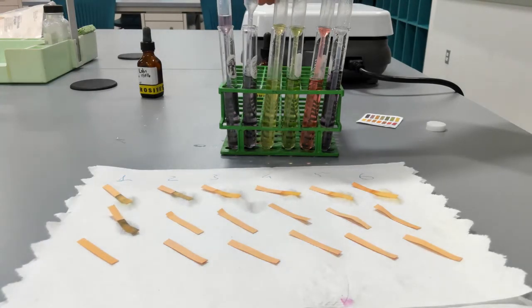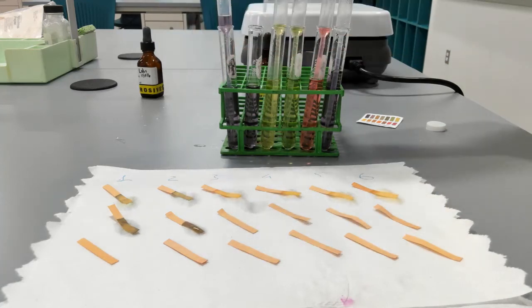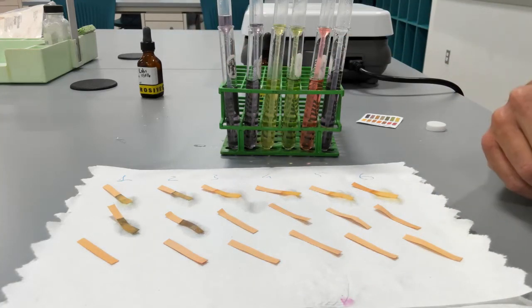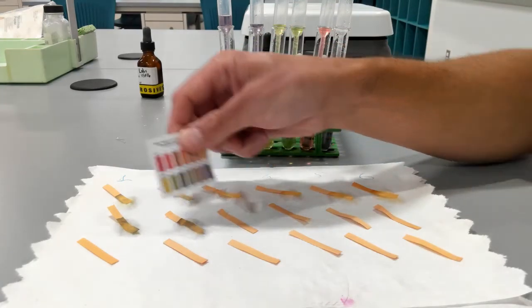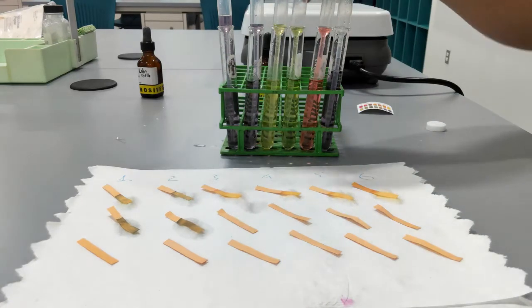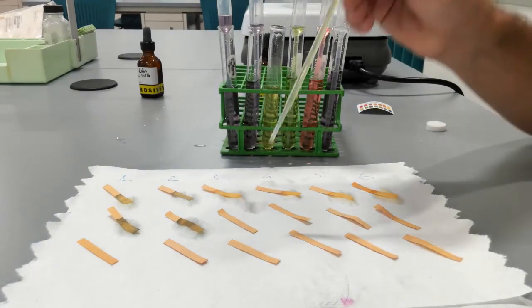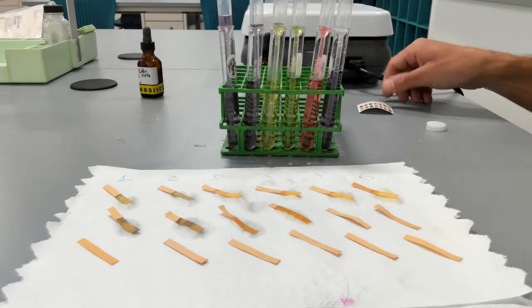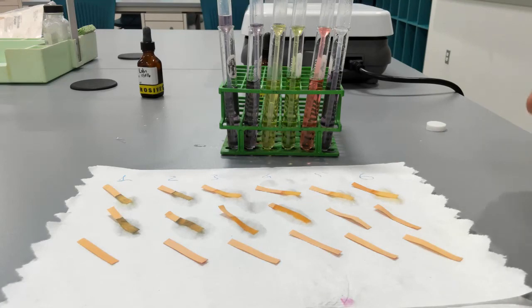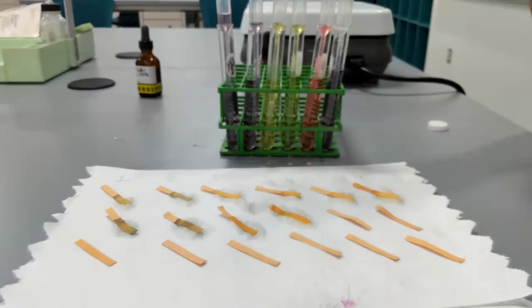This is for carbonate buffer. You can see that the color of the pH indicator paper corresponds to basically the same pH 8. In terms of the phosphate buffer, pH didn't change much, so same 7 and 7.